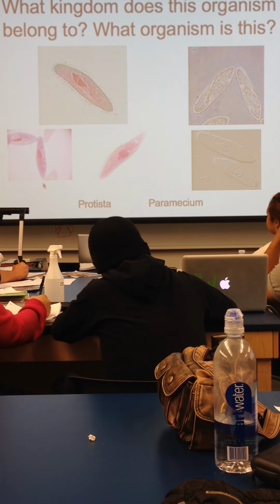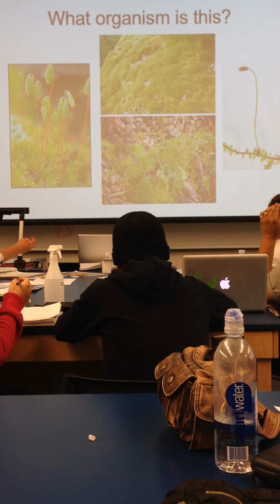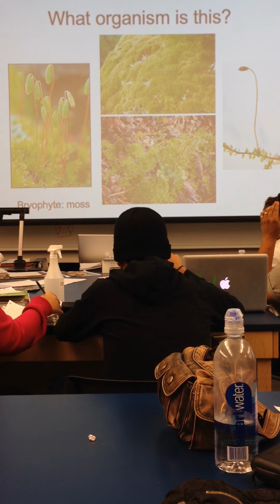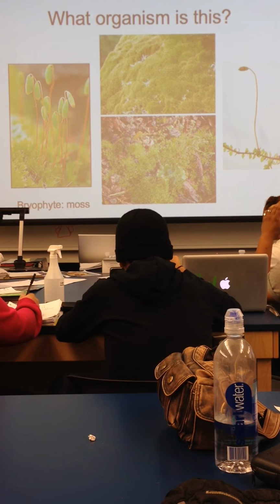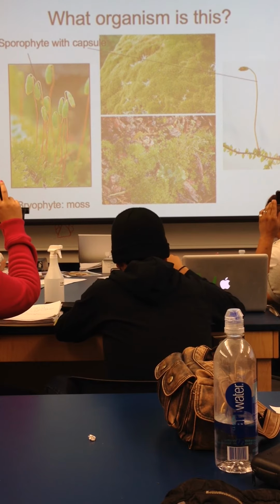Are you guys all okay if I move on here? All right. So what organism is this? Mosses. Good. So how do we know it's a moss, guys? Ah, good. Lecture students should know this, right? Sporophyte with the capsule.